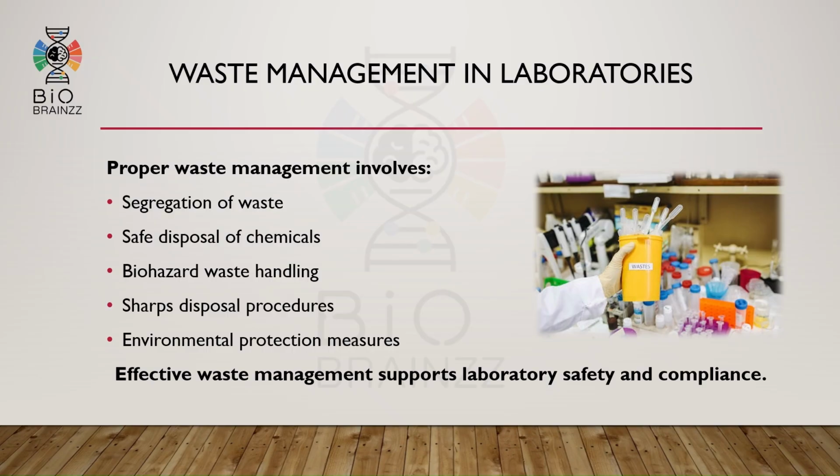Waste management is another important part of laboratory infrastructure. Laboratories generate different types of waste, such as chemical waste, biohazardous waste, and sharp objects. Improper disposal may harm people and the environment. So, laboratories follow proper waste segregation and disposal procedures to maintain safety and regulatory compliance.